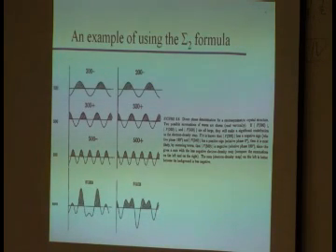So how does that look in real life? Well, here are some reflections. There's a 200, a 300, and a 500. Let's assume we know the signs for the 200 and the 300. They are minus and plus. The one that is questionable then is the 500. We could make it minus, we could make it plus. If we make it minus, we fulfill the "is likely to be" triplet relationship, right?